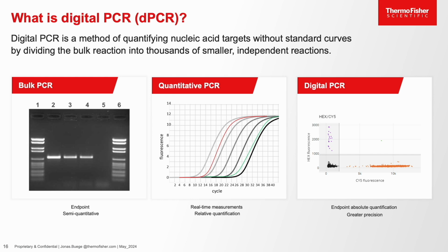Because no standard curve is required, this method is considered to offer greater precision and reproducibility when compared to other quantitative methods. I always consider it as 1,000 bulk PCR reactions that you can use to absolutely quantify your targets.